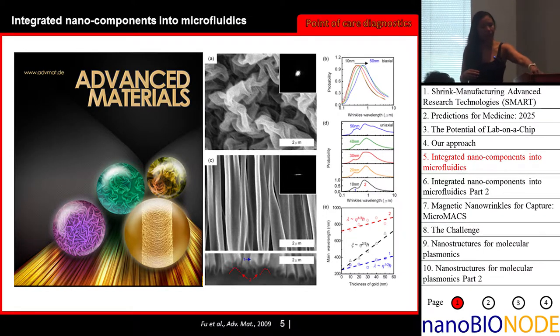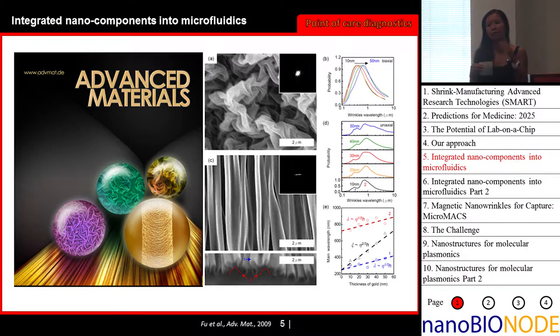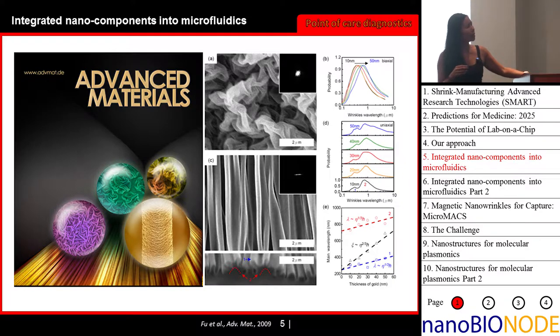So this is a shape memory polymer. You just saw the way the polymer shrinks, right? We were doing microfluidics with this, and it carries whatever is on the plastic. Whatever you print on the plastic, it'll carry it closer together. So you can imagine that if you have some sort of ink and the ink reflows, you can get microfluidic channels out of this. If you have a stiff material down, the stiff material can't shrink, so it buckles. And if you can control the buckling well enough, you can get very interesting features, and you can use them for a variety of different applications.